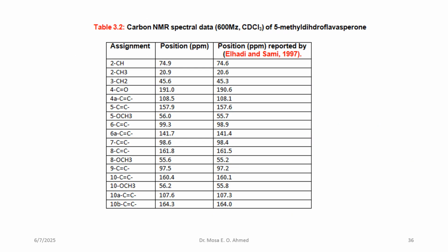Also, when performing carbon 13 NMR for this compound, 5-methyl dihydroflavasperone, and comparing the result obtained by experiment to the result obtained by other authors, we find the results are also typical to those reported in literature.